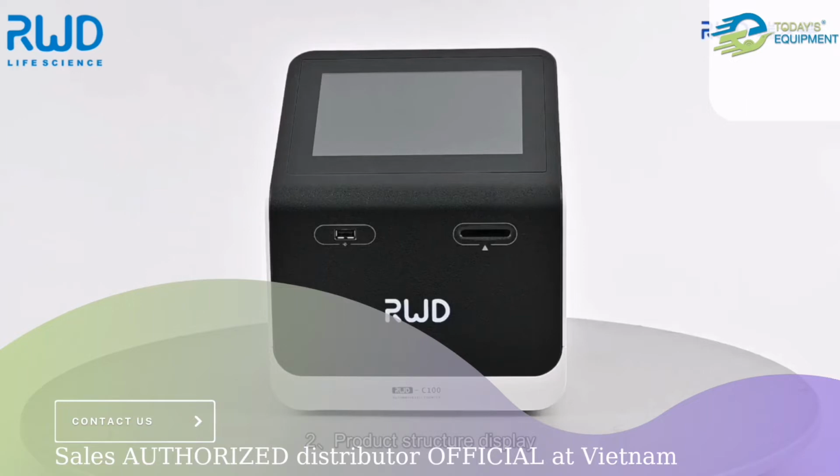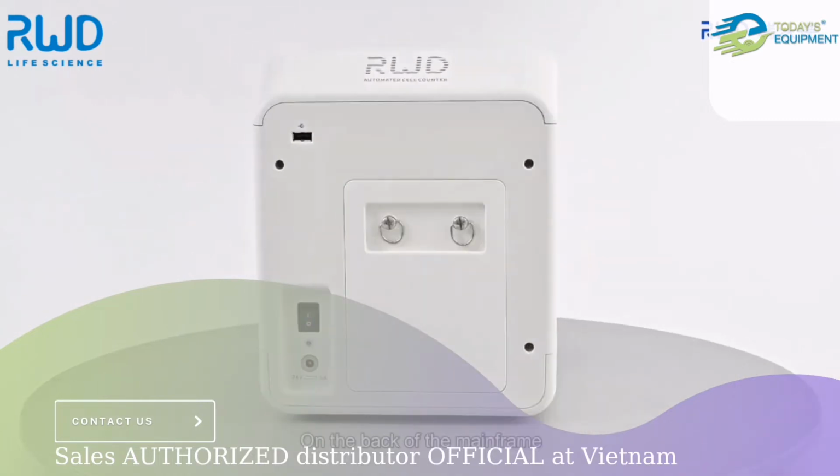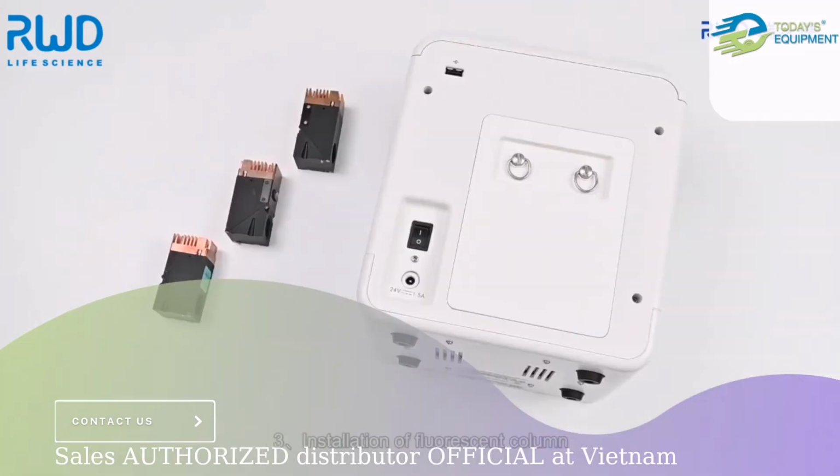2. Product structure display. On the front of the mainframe, there are the USB interface and the cell count slide insertion port from left to right. On the back of the mainframe, there are the heat dissipation hole, USB interface, power switch, power interface and backboard from top to bottom.